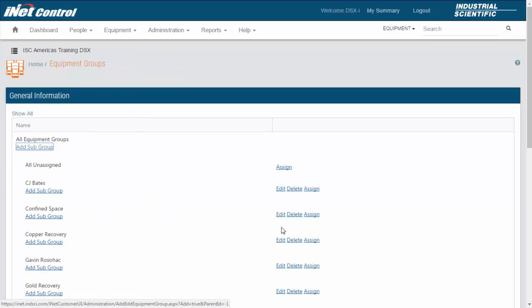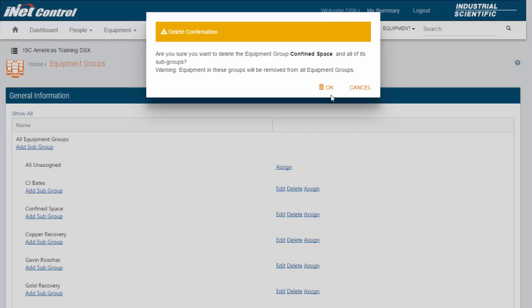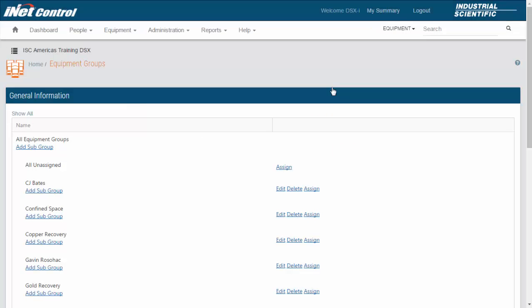If I delete the equipment group, it will remove all the instruments from this group and put them back up into the all unassigned group. Equipment groups can be used for many different types of groupings. This is just a small example of what sometimes people will use them for.